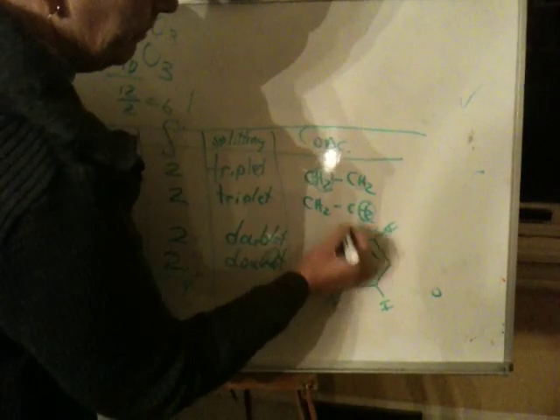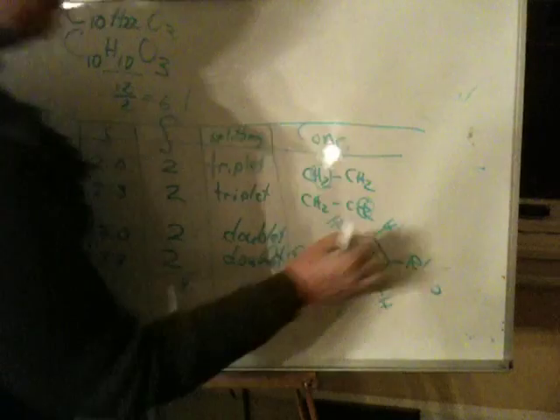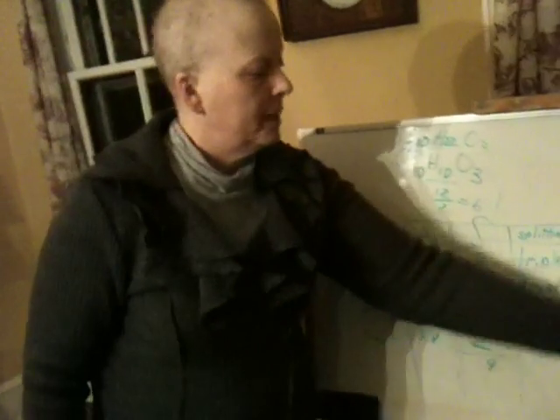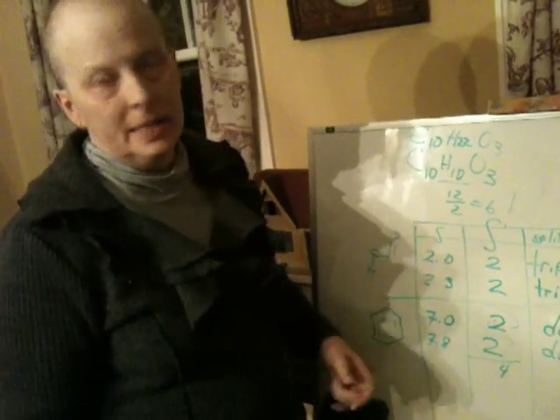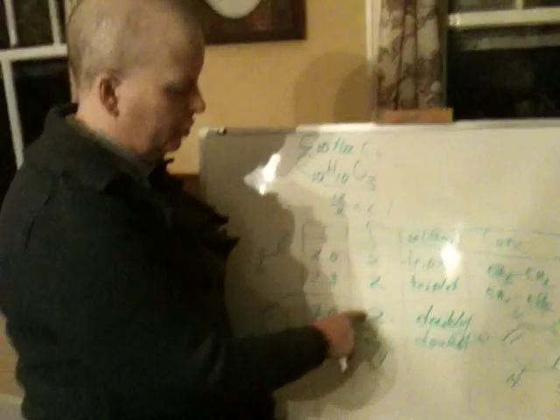Now notice, you're going to see this coming up over and over again. Notice we are interpreting differently when we're at the high ppm than the low ppm. At high ppm, the effects are mainly due to pi circulation. And if you use the traditional treatment here, you would say 2 CH2 next to a CH.